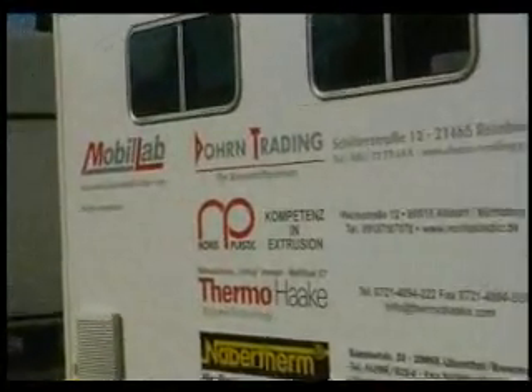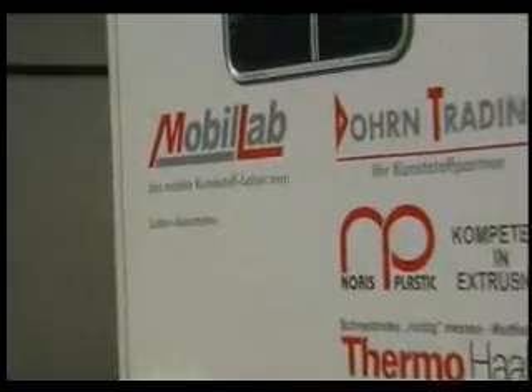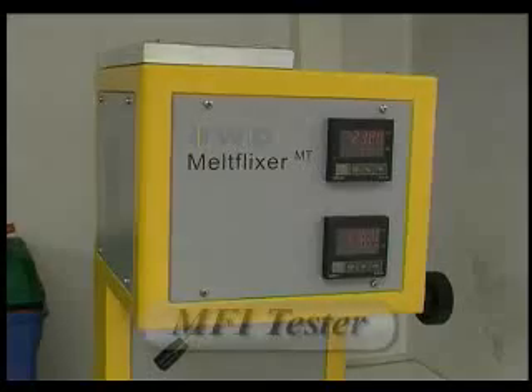Other important tests can be carried out in the mobile lab, such as MFI testing through the MFI tester.